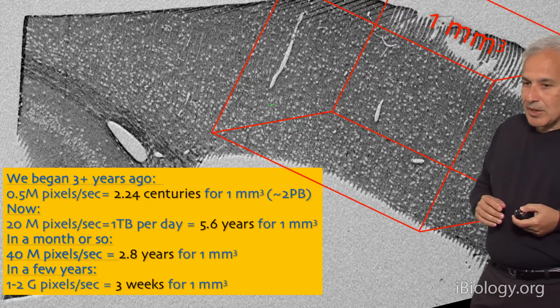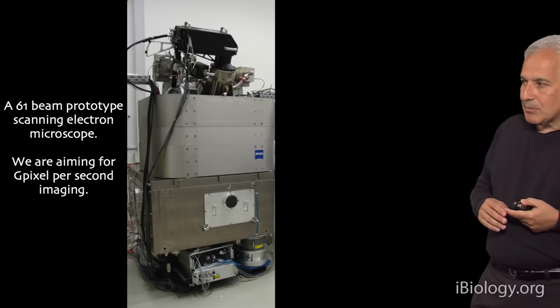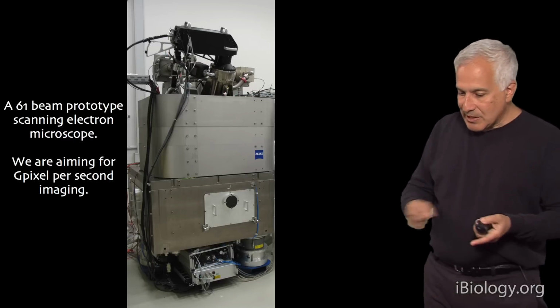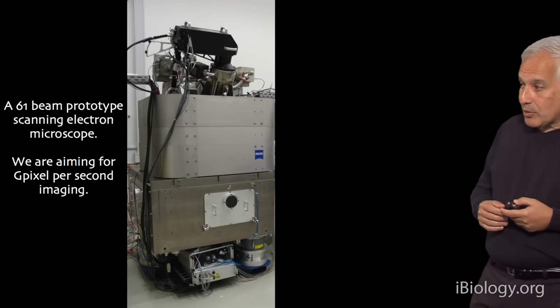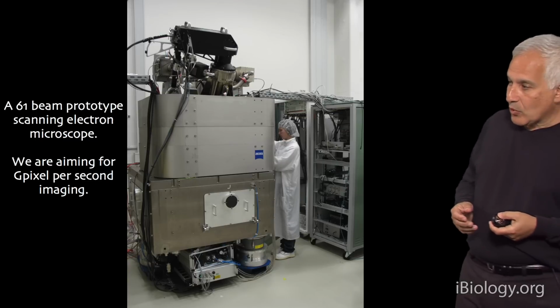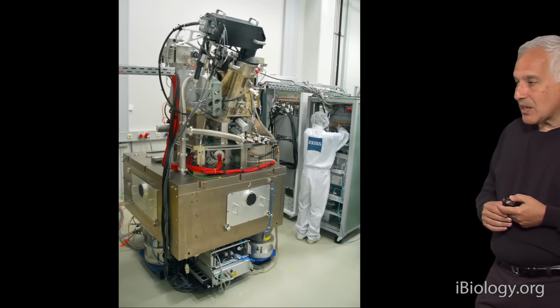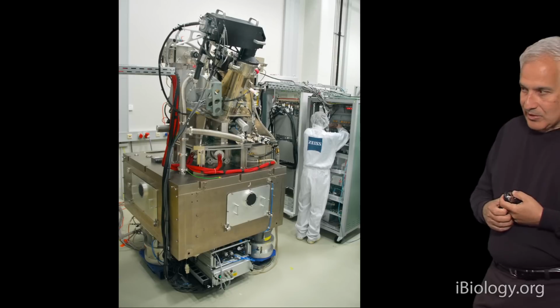And in collaboration with Zeiss, a company in Germany, they have been building a 61-beam scanning electron microscope, which gives us 61-fold more beams scanning at any one time. It's like having 61 microscopes all in one. The original prototype is a hefty-looking device, especially when you compare it to the size of a normal-sized human being. It's a massive and impressive piece of technology, and German engineering really comes to the fore in devices like this.